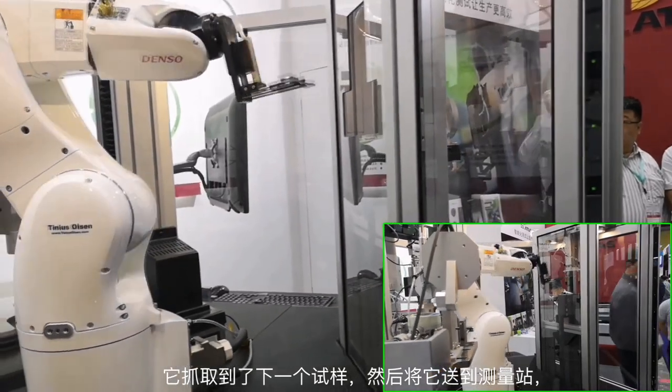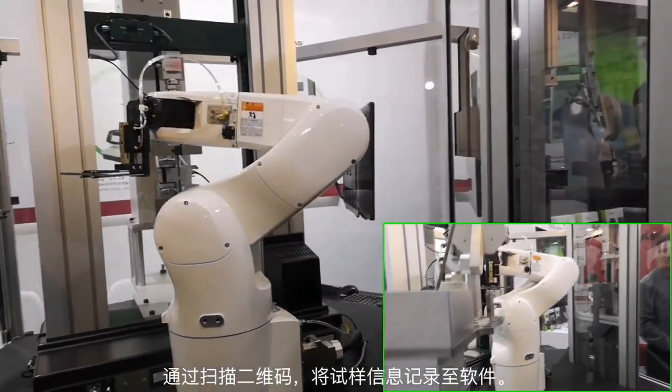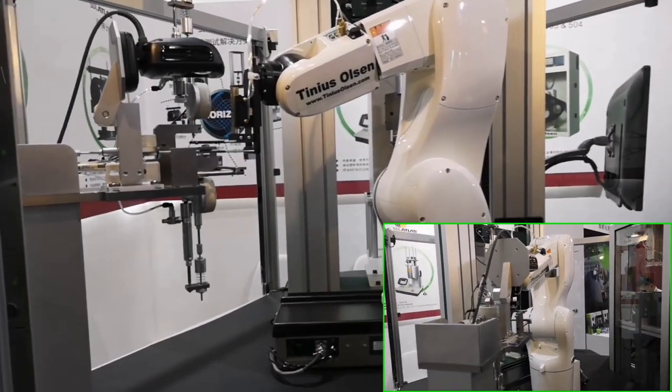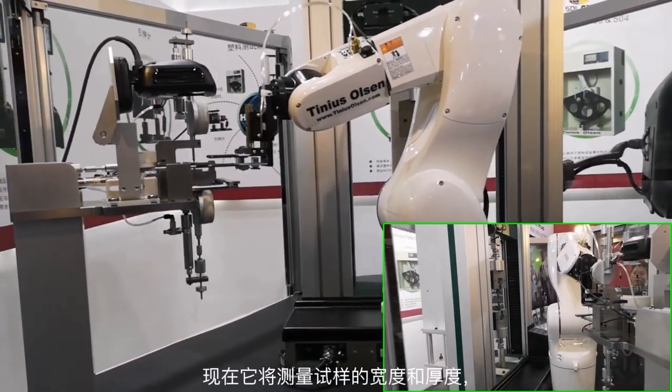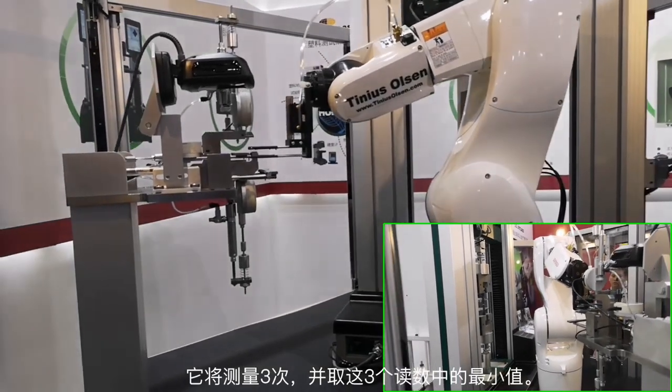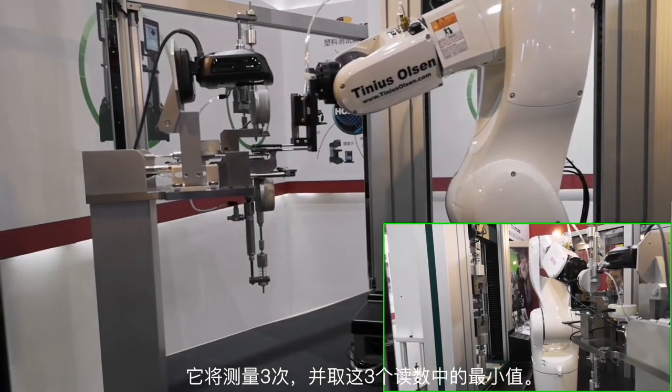That's going to bring it over to the measuring station where the barcode will be read into the system. Now it's going to measure the width and thickness. It's going to do it three times and take the minimum of those three readings.